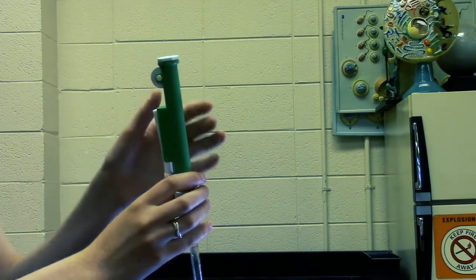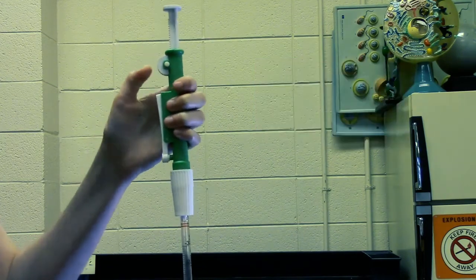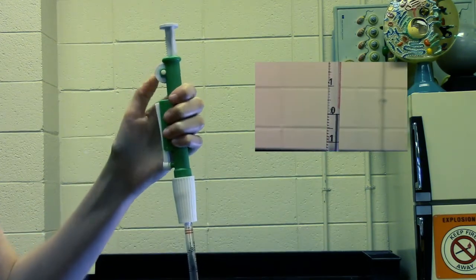This pipette has a roller on the side that you use your thumb to control. Moving the roller downwards takes in the liquid and moving it up releases it.